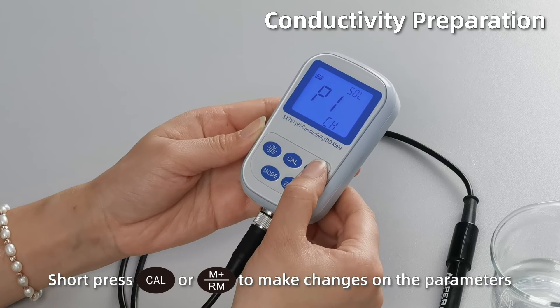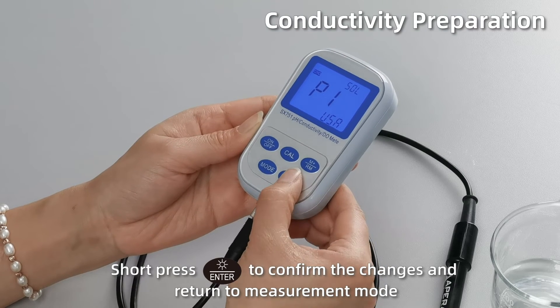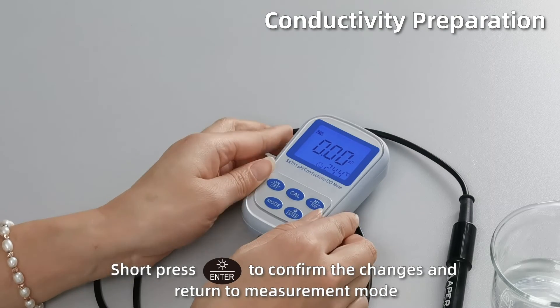Short press cal or M plus to make changes on the parameters. Short press enter to confirm the changes and return to measurement mode.